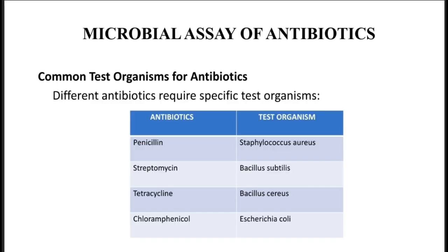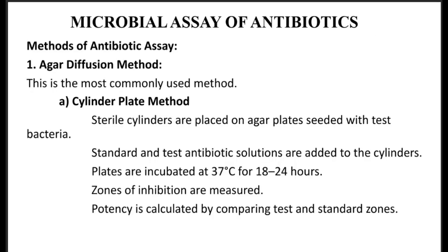Common test organism for antibiotics. Different antibiotics require specific test organism. Antibiotics test organism: penicillin, Staphylococcus aureus; streptomycin, Bacillus subtilis; tetracycline, Bacillus cereus; chloramphenicol, E. coli.